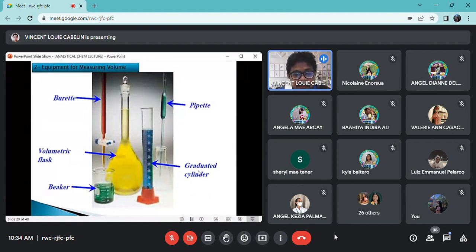The graduated cylinder is a cylinder with different graduations. Those lines, each of those lines is a graduation. That's why it's called a graduated cylinder. And each graduation is a measurement of a liquid, right? So you have beakers from 10 ml up to 2 liters, even 5 liters. We have that in the laboratory. You have burettes. When you do titration techniques, burettes also have graduations that can measure how much liquid is being passed through the burette. So still you are measuring liquid.